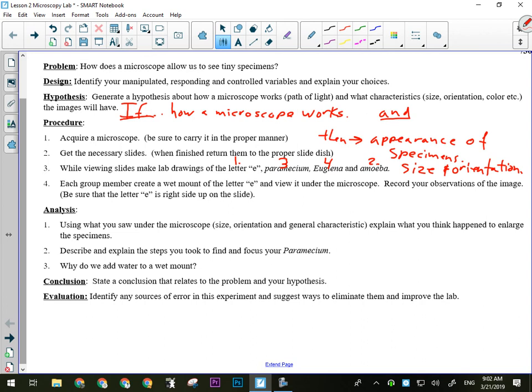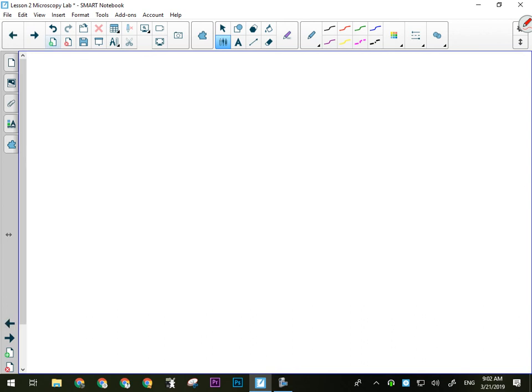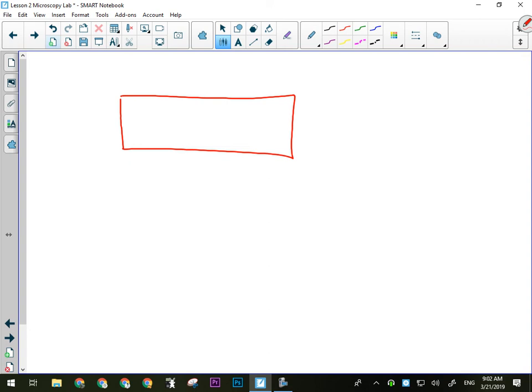So for a wet mount, this is what we do. You're going to have a blank slide, which is a rectangular piece of glass. You are going to cut a letter E out of an article, not a headline, out of an article. And you are going to put that cut piece of paper in the middle of your slide so that the letter E is right side up. Then you're going to take a drop of water and drop it onto the letter E. What I would advise is if this marker is the eyedropper, put the eyedropper right on the letter E and squeeze. If you don't, the letter E will just flip over when the water gets on there. You want to kind of soak the letter E so it sticks to the slide.